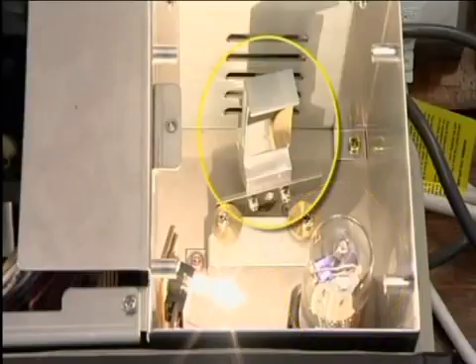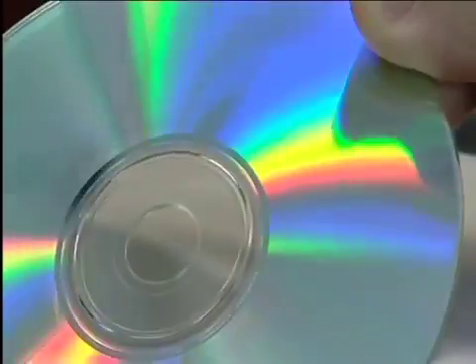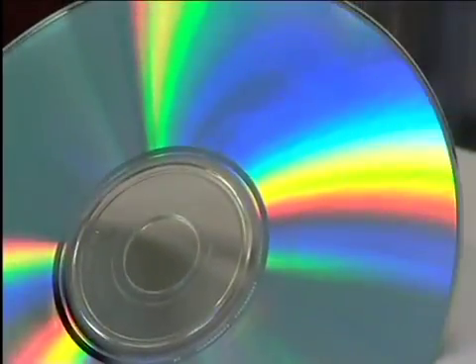This mirror directs light from the appropriate source into the monochrometer. This contains a diffraction grating that acts rather like the playing surface of a CD to split the light into its constituent wavelengths. Different wavelengths correspond to different colours.